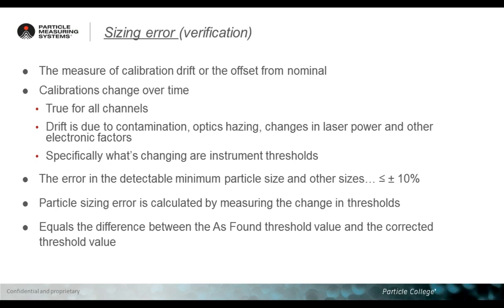So how big was the error your instrument was making in detecting 0.5 micron instead of 0.49 or 0.48? The accepted error is 10%.